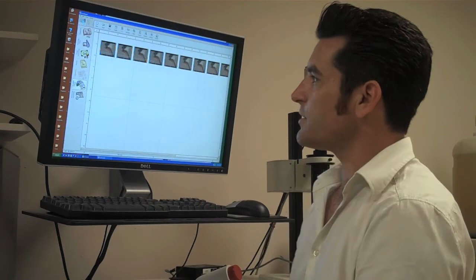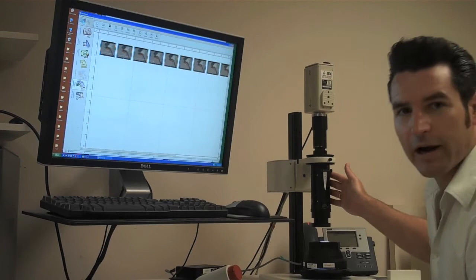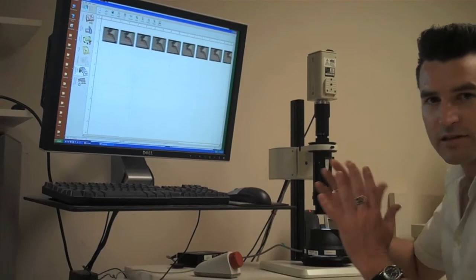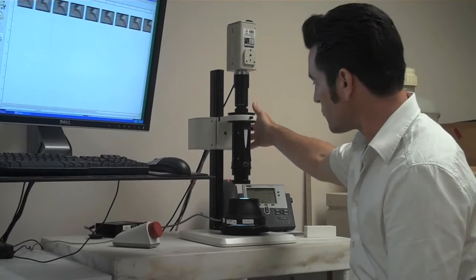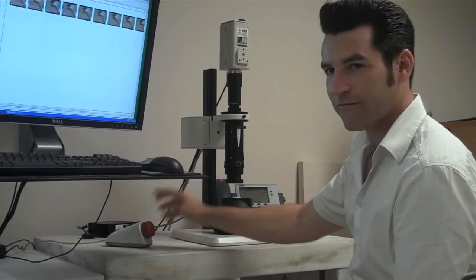So what I'd like to do is show you what I've done here. I've got a very small wasp underneath the microscope here. This is an illumination dome. We're actually showering the specimen in a cloud of photons produced by 48 high-intensity LEDs inside here. This is the camera here. And this is what we call a Z-stepper focusing rig. And that allows us to mechanically, or using this control knob here, to focus back and forth through the specimen.